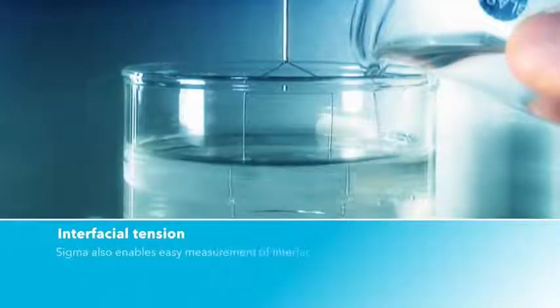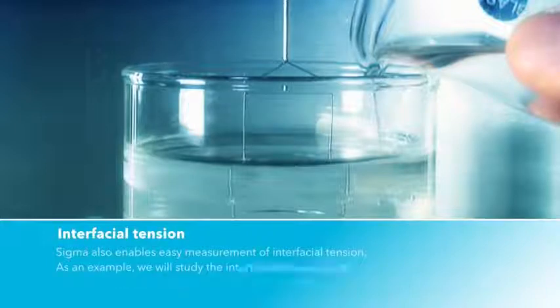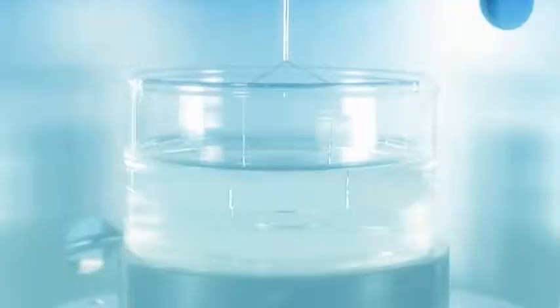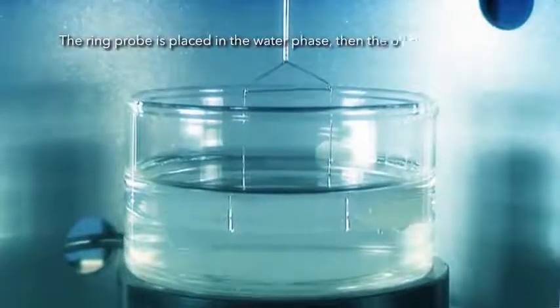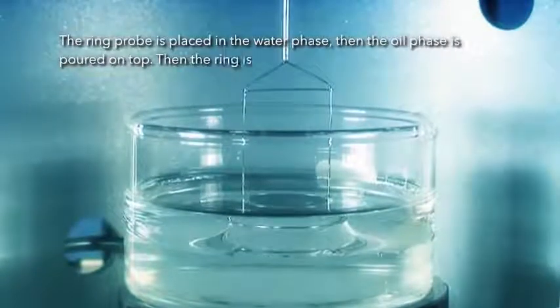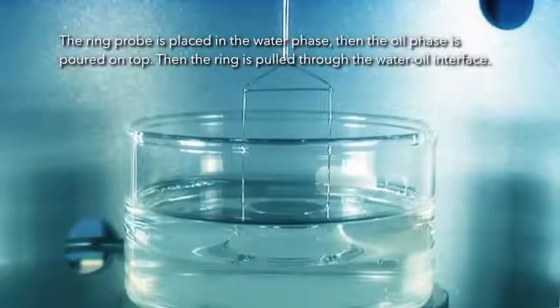Sigma also enables easy measurement of interfacial tension. As an example, we will study the interface between water and an oil. The ring probe is simply placed on the water phase, then the oil is poured on top. The ring is then pulled through the water-oil interface.